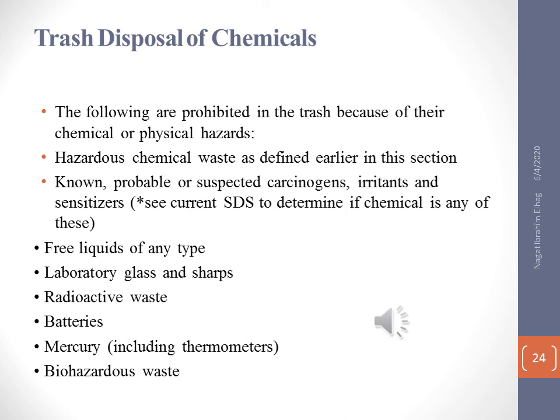Also radioactive waste: each waste has a special type of can, so you should follow the safety steps to keep your lab and the environment clear from chemical waste.